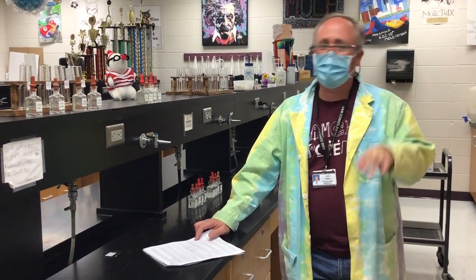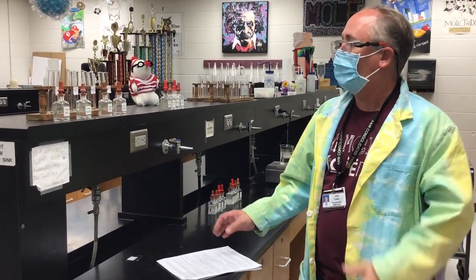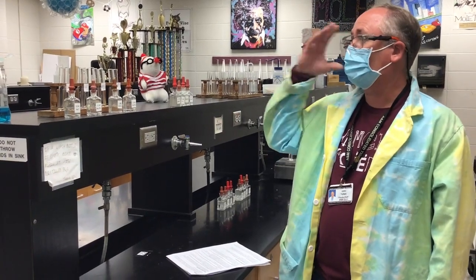Okay, so welcome to the anion cation lab. This will be for the first unknown, so A1. If the first letter of your last name is A through F, this is your unknown. So what we're going to do is we're going to test.